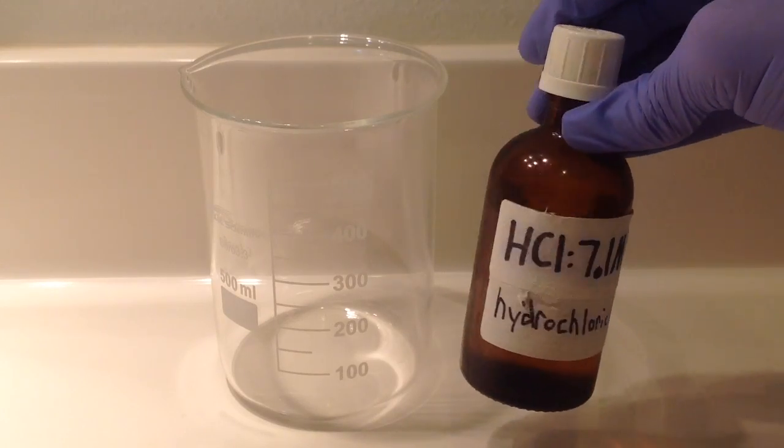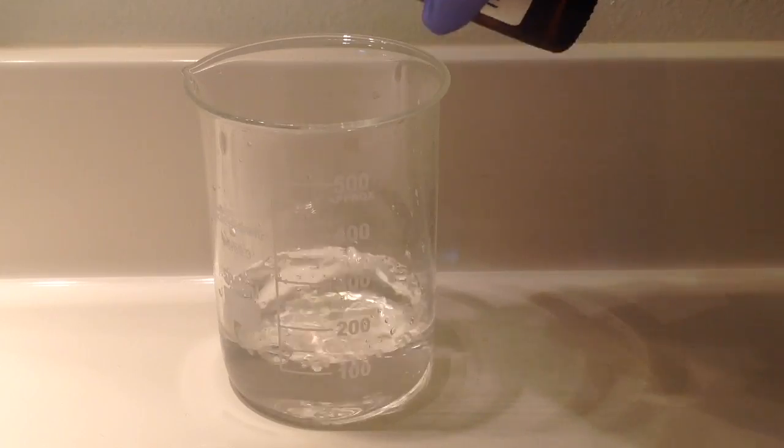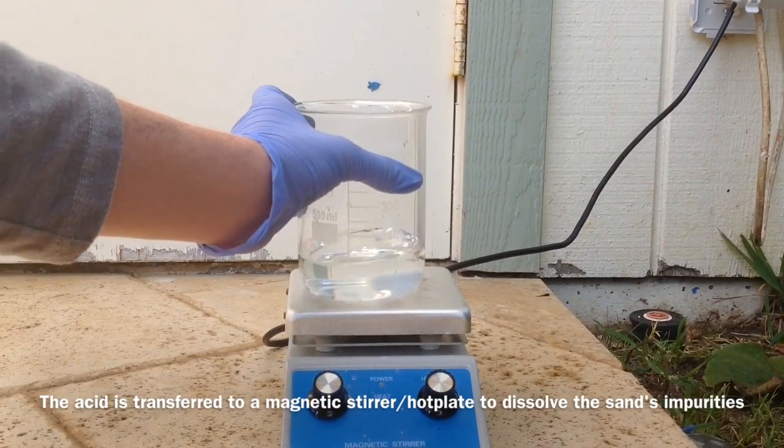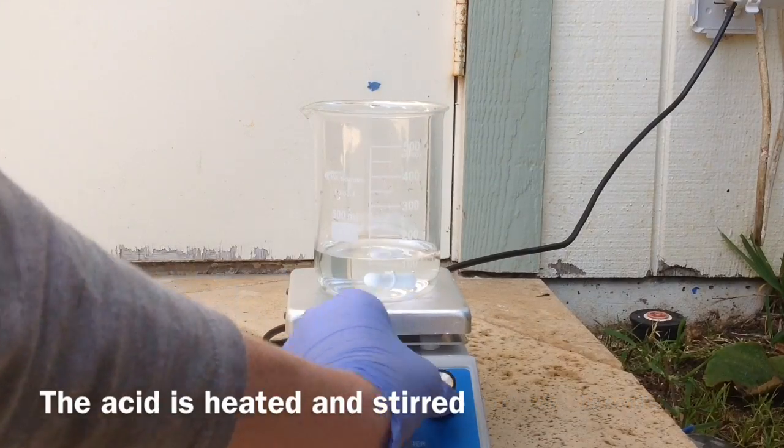We take some HCl and measure out about 100 milliliters of it. We transfer the HCl to a hot plate stirrer and we're going to dissolve the sand's impurities into the HCl.